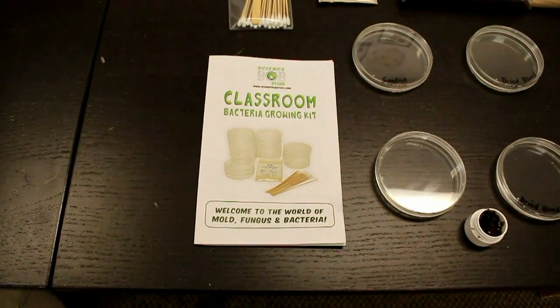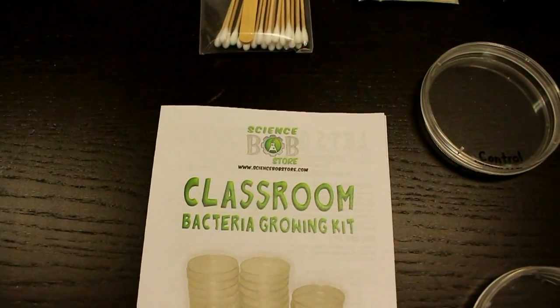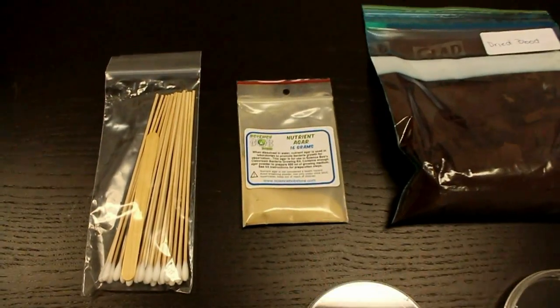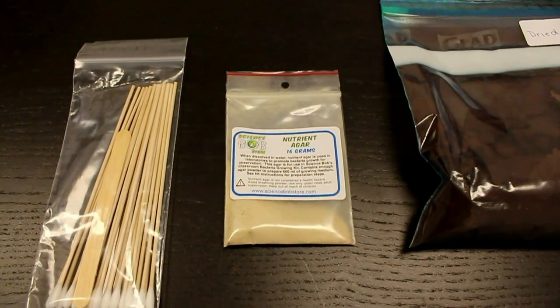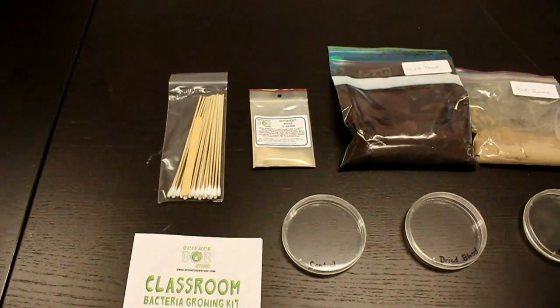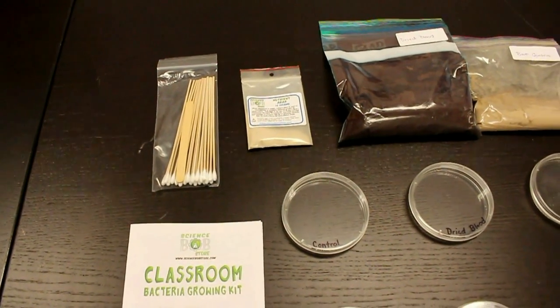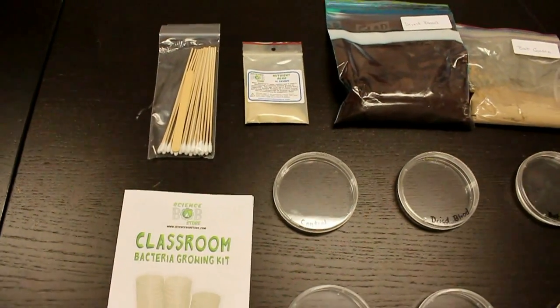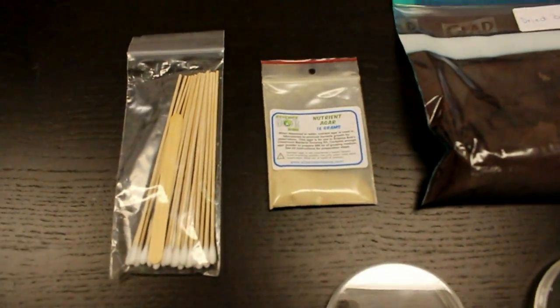So this is the kit we're going to be using to conduct our test. We purchased it online from www.sciencebobstore.com — they have a whole bunch of science equipment you can use to do tests like these. We're going to be cultivating our bacteria cultures using this nutrient agar. Nutrient agar is a substance derived from either algae or kelp. Once you add boiling water to it, the cells of the agar expand and explode, and what's released is similar to something like jello. This jello is what the bacteria feeds on.